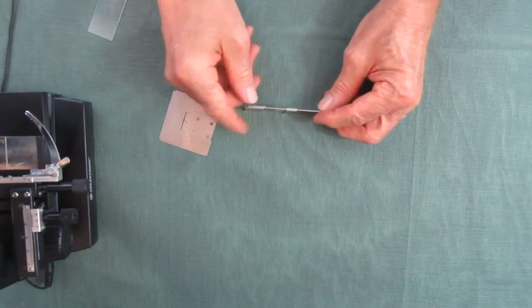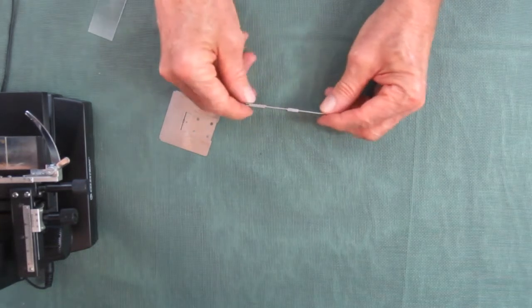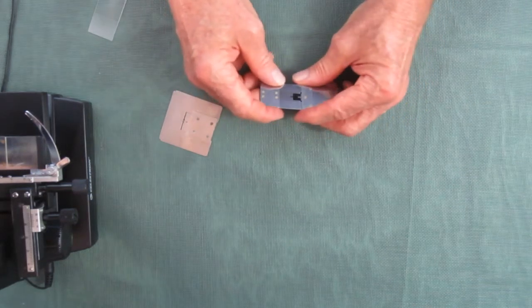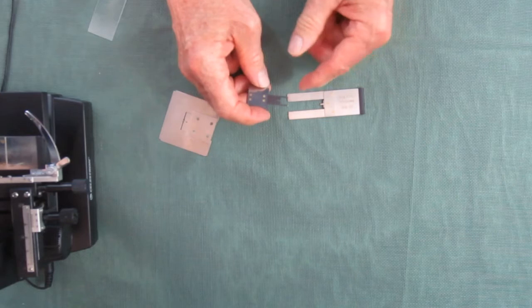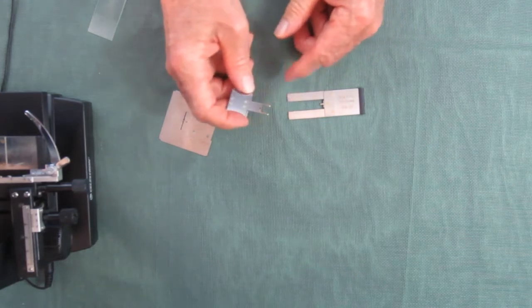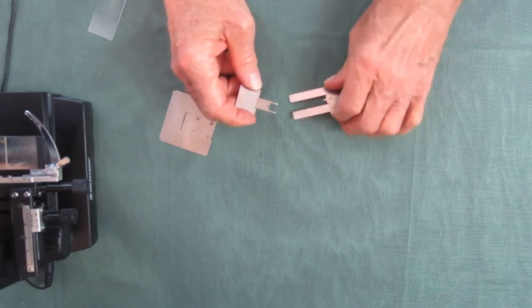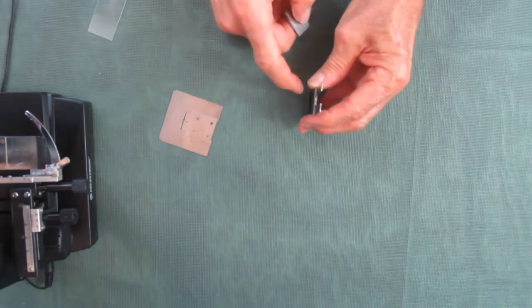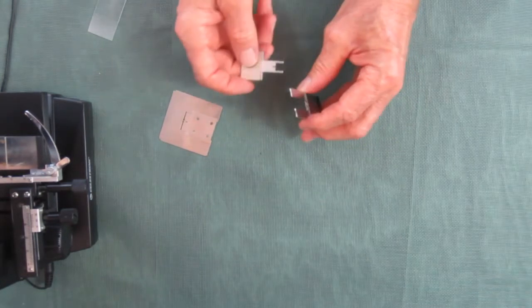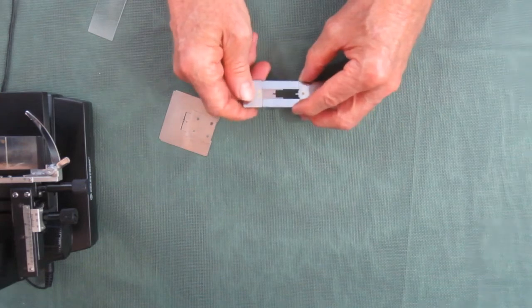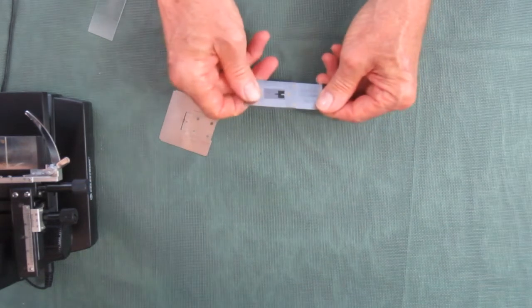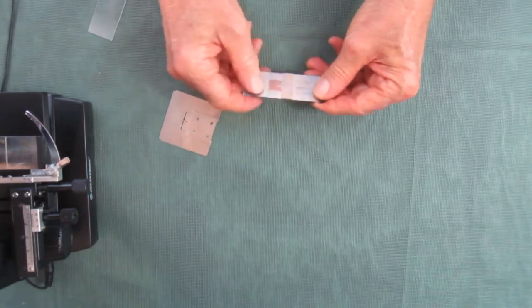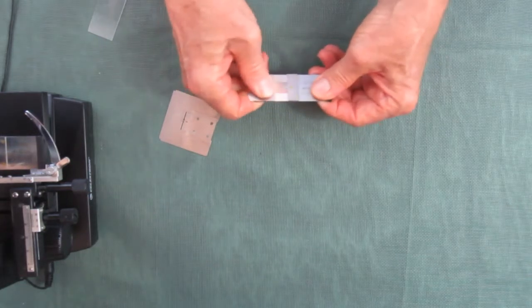You can see with this one it has two stems sticking out and they actually insert into cavities inside here. It gives you a very flush fit and no amount of pressure is going to flex or bend that.